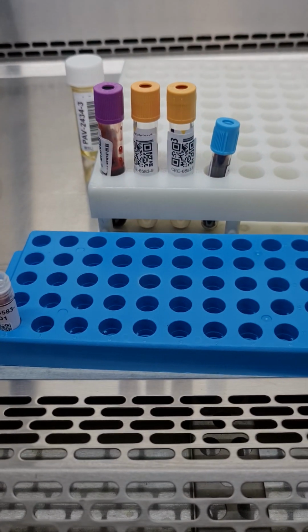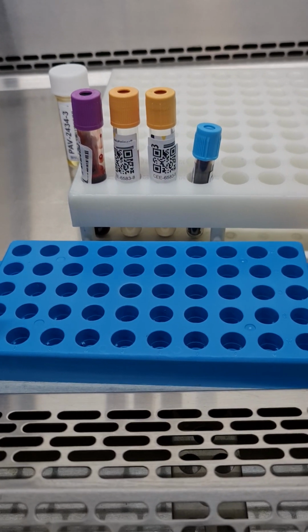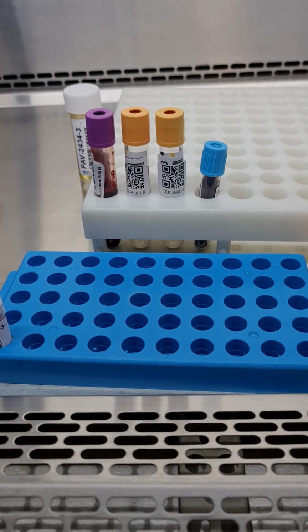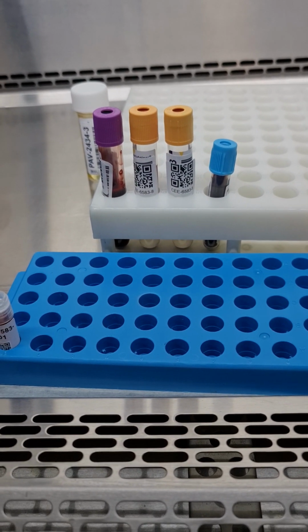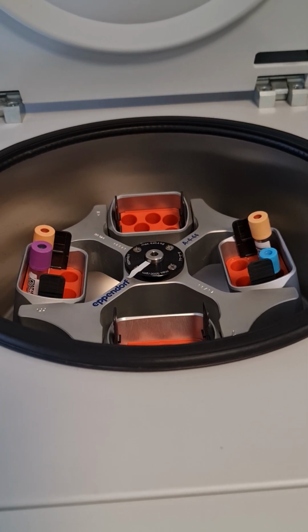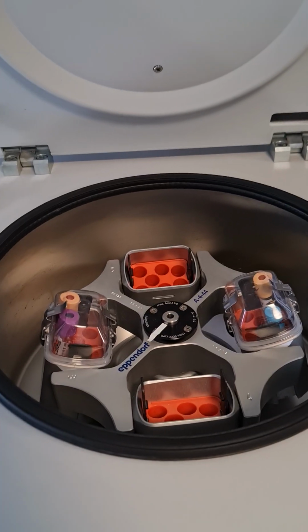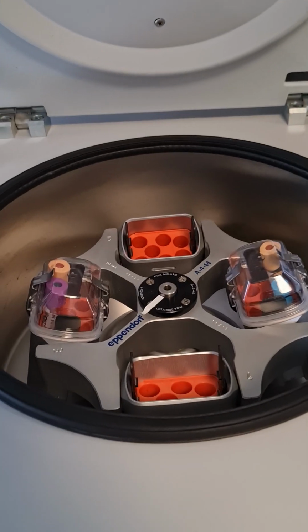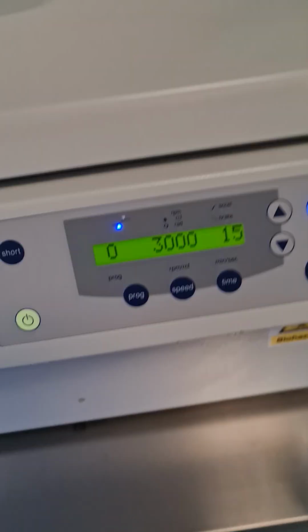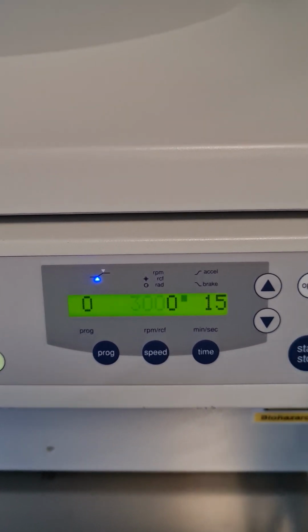Now I'm going to centrifuge all the tubes, spinning at 3000 RPM for 15 minutes. Just closing the centrifuge and start spinning at 3000 RPM for 15 minutes.